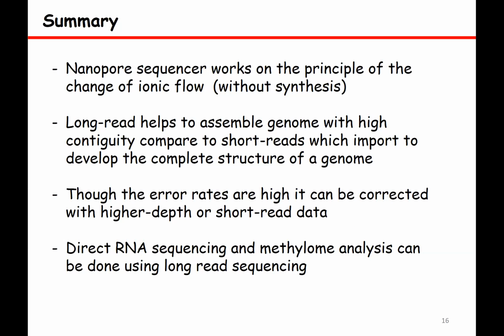Nanopore sequencing technology can have high error rates, but it can be managed with the tools available, especially when you increase the read depth, or when you use short read technology. For now, you have to use this method, but in the future, development is going on, like using double sensors, which means that when you get highly accurate signal graphs, they can be converted into high quality bases, so that the error rate can be minimized or eliminated.